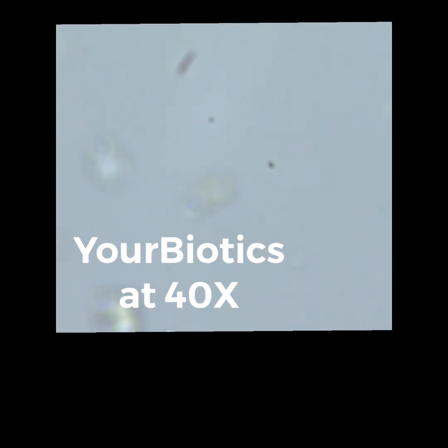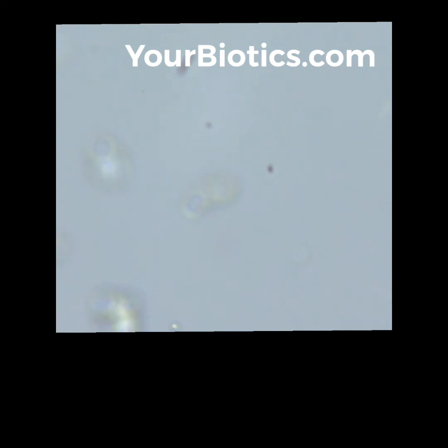This is Your Biotics under the microscope. We simply put it in some deionized water and let it go. We're focusing in on some other things. Remember, this is a three-dimensional world, and a microscope is only looking at one particular layer of that three-dimension — a two-dimensional look at a three-dimensional world. So you'll see some things come in and out of view. All kinds of microbes again, and you'll see the movement that's there.